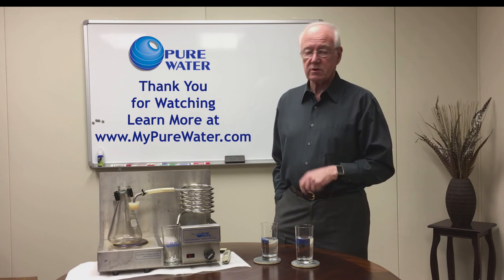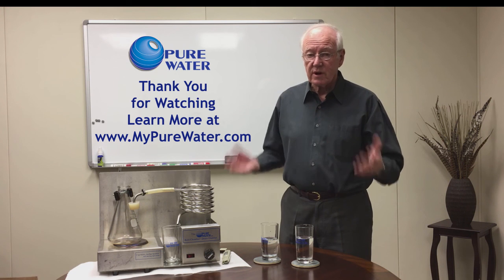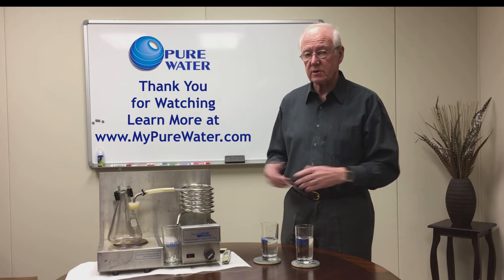Later on I'm going to show you how a distiller operates. We're going to read the numbers as we go and I'll show you how it works.